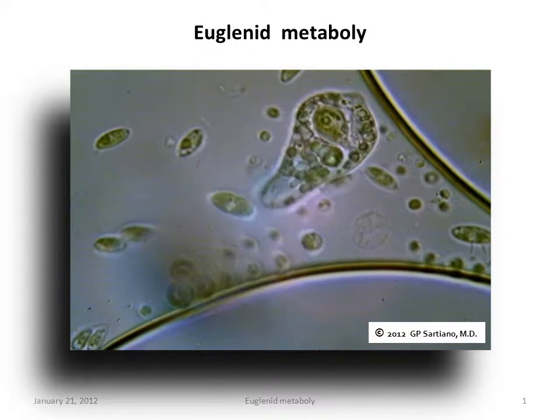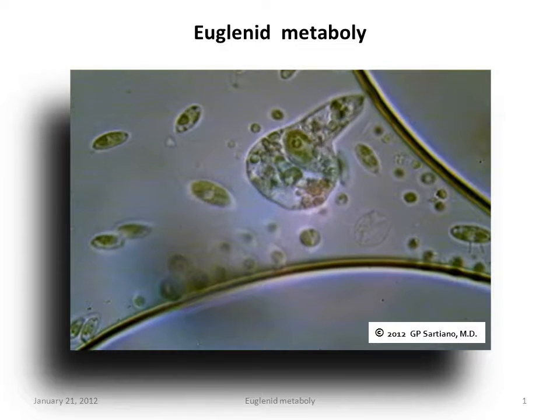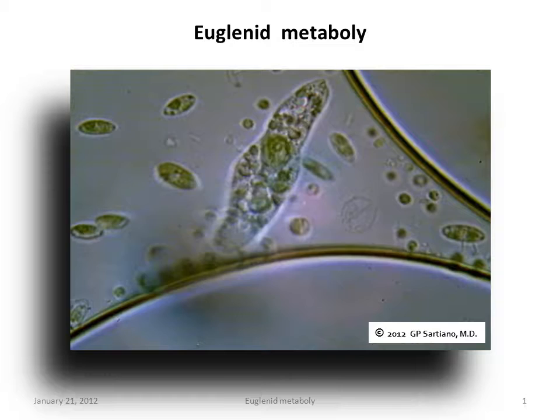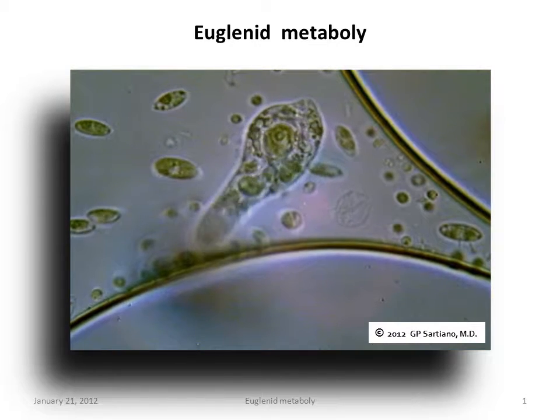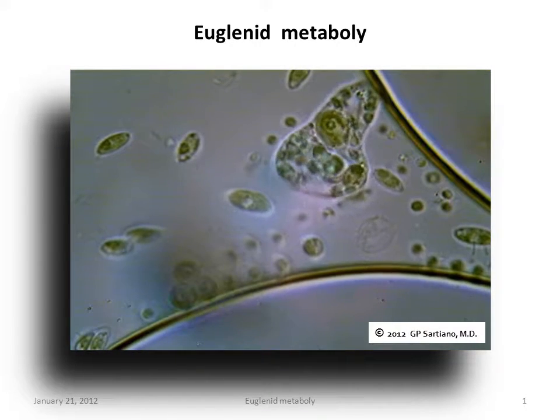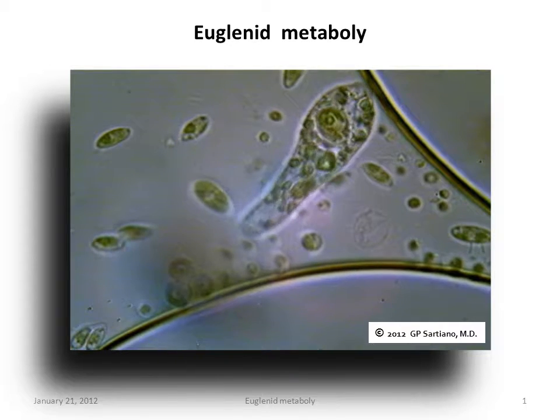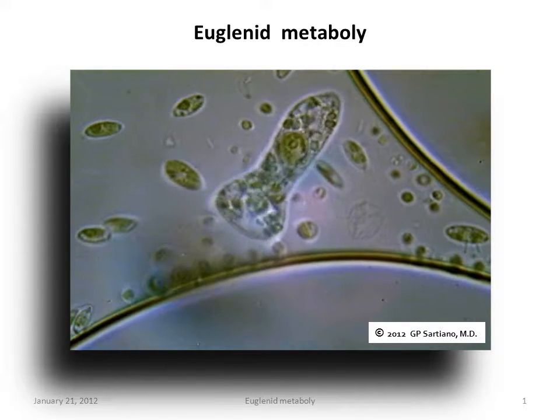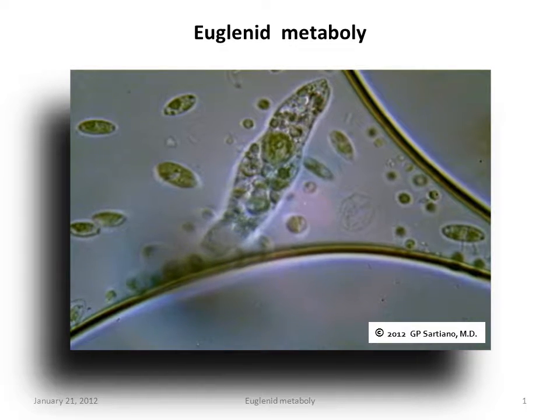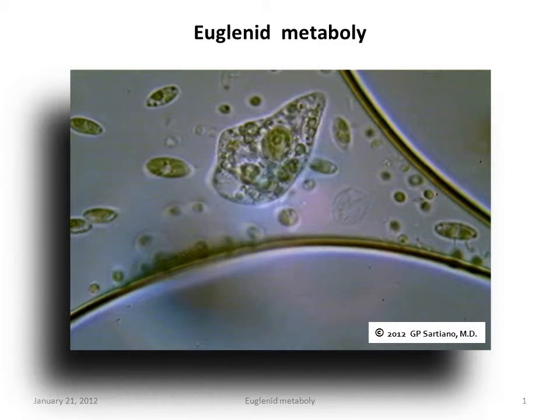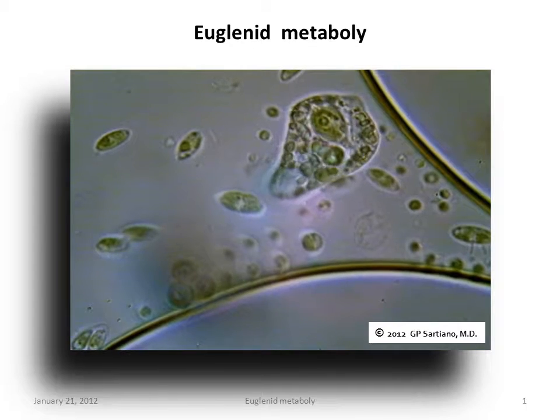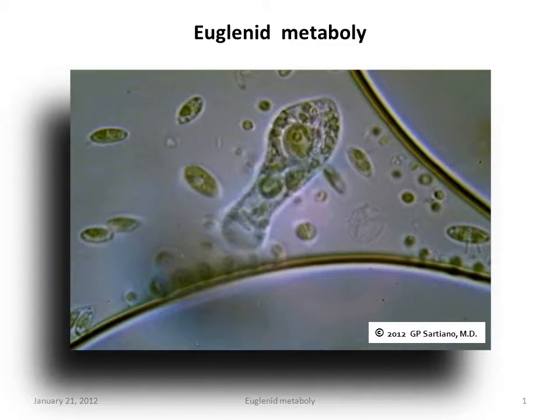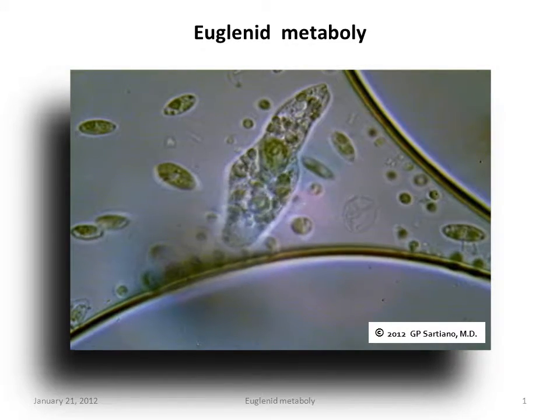The term metaboly is a descriptive one used in reference to the undulating, squirming, contractile, shape-changing type of movement common to many euglenid organisms. In this initial video, the nucleus of the organism is visible as a membrane-bound semispherical object midway in the length of the cell.